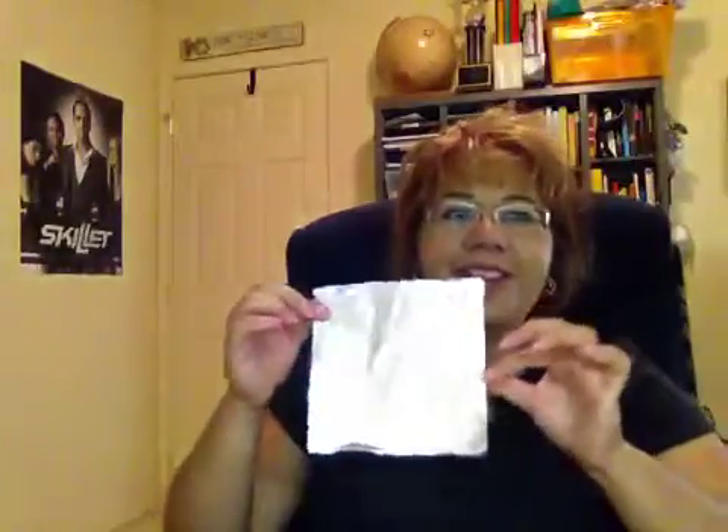There's also a little piece of foil. There's nothing special about this foil other than it is part of the contents of your kit — they just packed it on top of the box because it was easy to keep flat that way. So put it aside. If you do happen to wrinkle it or tear it, foil is pretty easy to get a hold of, so it's easily replaced by probably just what's in your own pantry.